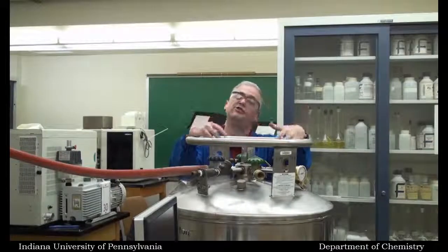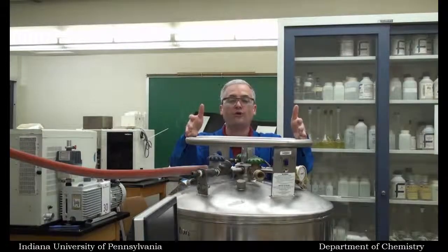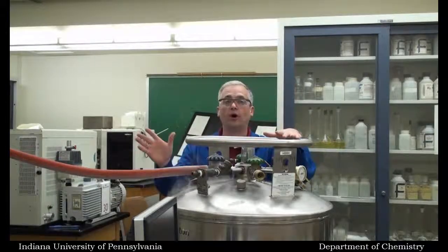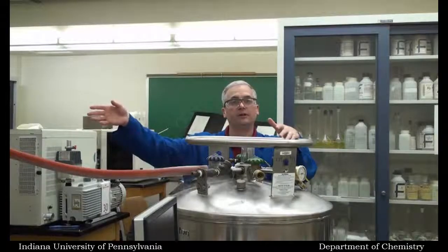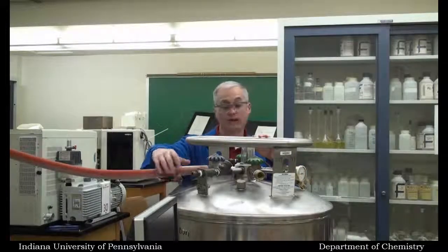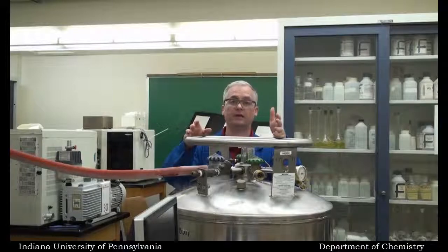But liquid nitrogen is cheaper than getting it from Matheson. All right, so we're saving money. That's wonderful. So you can usually get around 2 to 3 fills out of a tank. Now, what if a tank doesn't have enough to do a fill all in one? What you can do is you can set this up and you can transfer the liquid nitrogen until it's empty. Then you can get another one, let the hose cool, or I guess warm up, and then attach a hose and then finish your transfer with a new tank. That's totally doable, although it takes a lot longer.